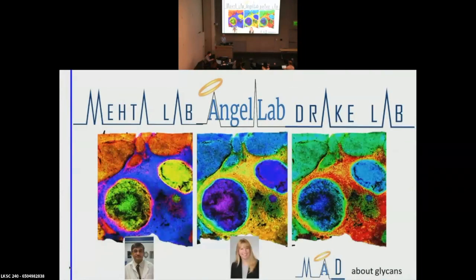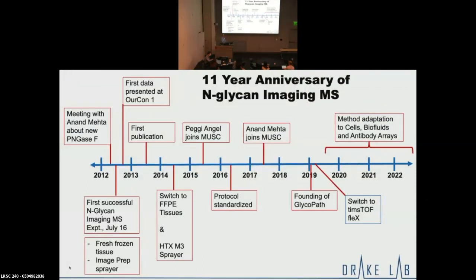As Peggy mentioned, it's been very fortunate to work with Peggy and our colleague in Meta. Peggy also has a huge glyco interest, and so we all developed a lot of technologies together, which I'll summarize here in a second. We're now 11 years since we did the original imaging MS, and it has come a long way. As Jeff mentioned, once the timsTOF hit, that's just taking it to another level. Speed, accuracy, the image quality, it just lets us do so much more.